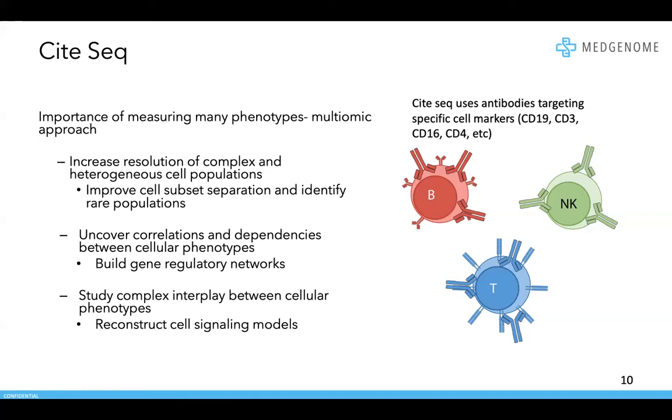So, for example, your gene expression data might tell you about the cell types in your sample. It might tell you about the subpopulations. But if you don't get enough genes expressed for certain cells, those cells will be considered dropouts and they're not included in your overall data. There's not enough information to assign those cells to maybe a cluster or to group it together with other cells in the same population.